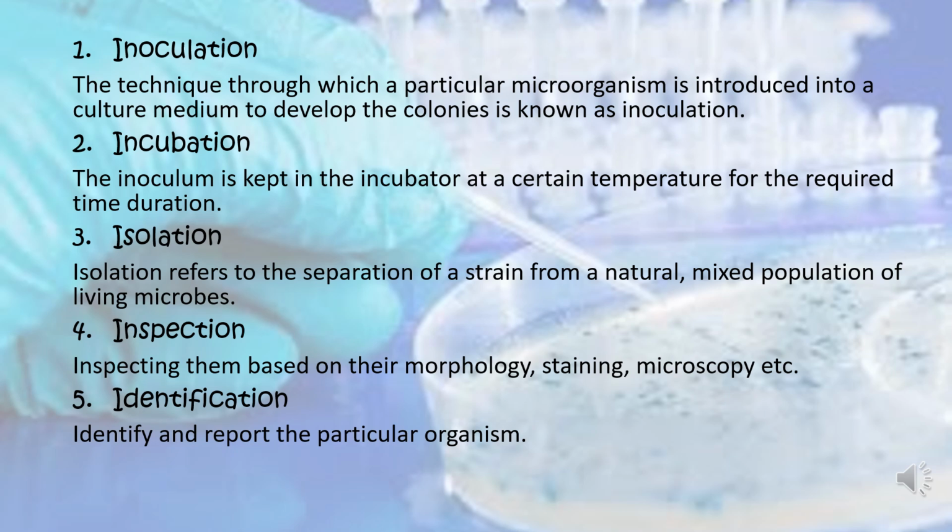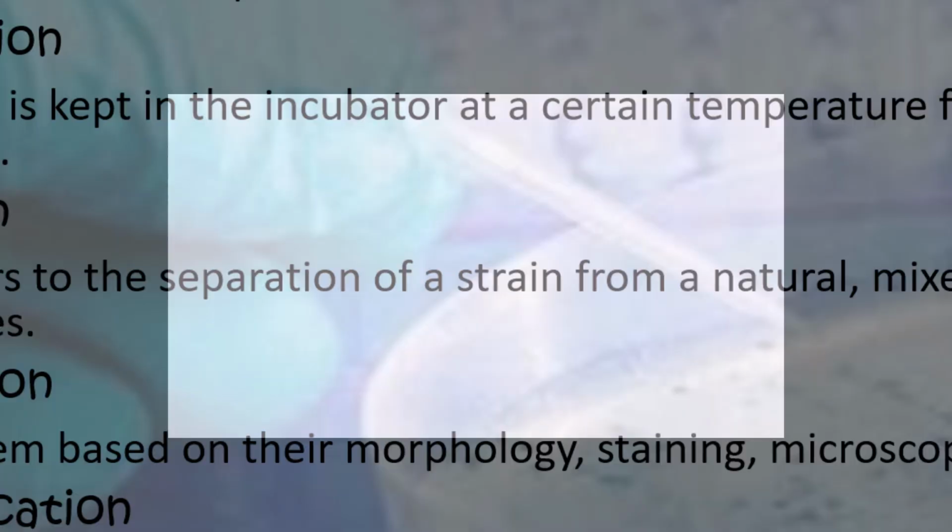Inspection and identification take place through various methods like morphology and staining, implemented to identify microbes through their cell properties using a microscope. Some microorganisms such as viruses require an electron microscope to be seen, and not a simple microscope. Biochemical tests and molecular analysis are also used.